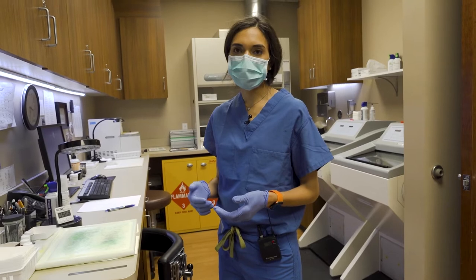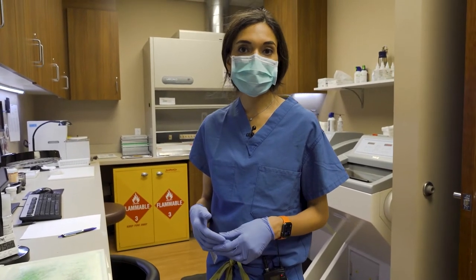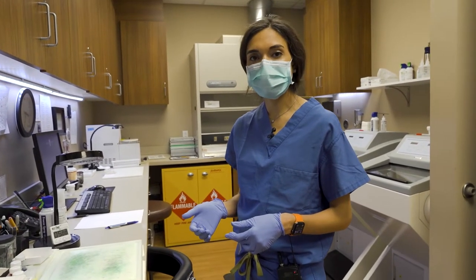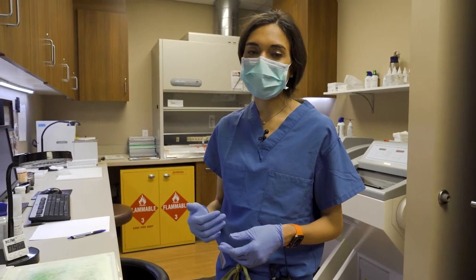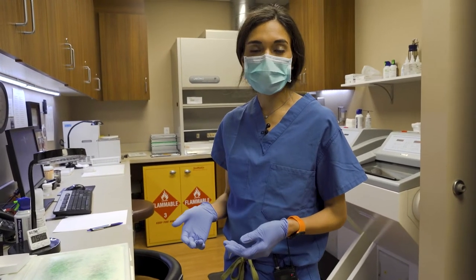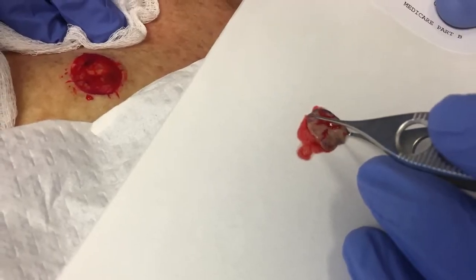Oftentimes, people are curious what happens to the skin after it's been removed during Mohs surgery. This is a tour of our histology lab and a brief explanation of the different steps that your skin goes through during the processing, so that I or another Mohs surgeon can examine your skin under the microscope and tell whether or not we've gotten all the skin cancer out.